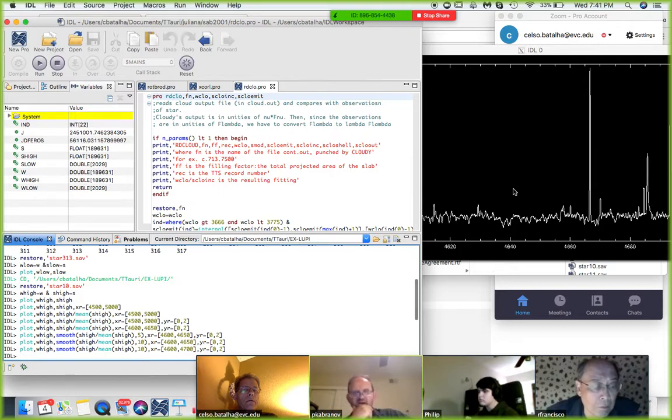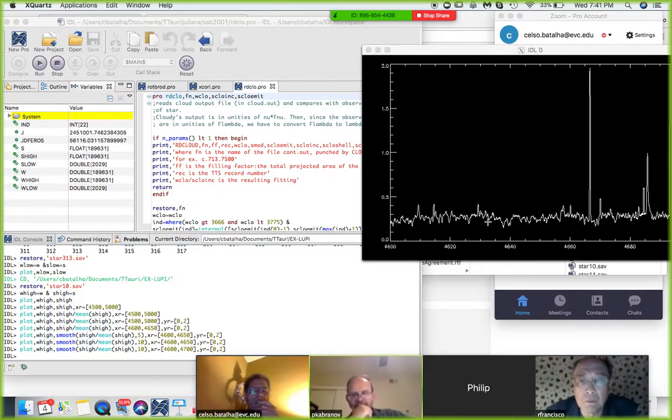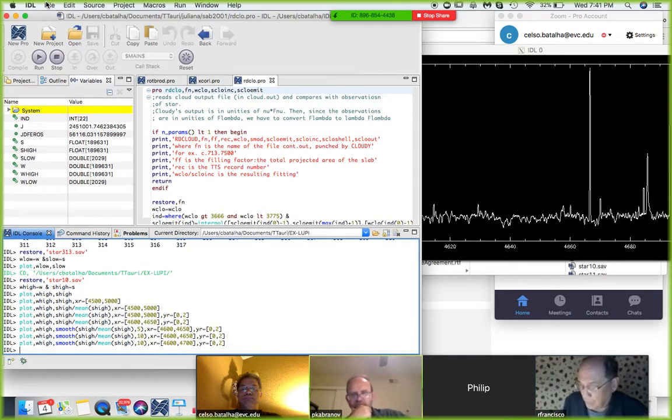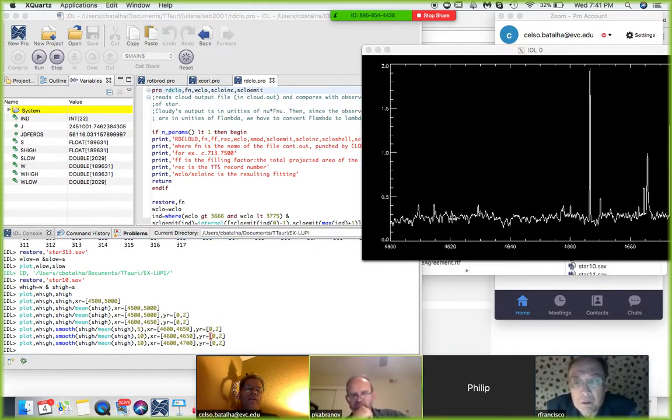So we are deciding how to do the filter. This is the type of thing that, when we start working with data, we make this decision. Say, oh, I don't like the way the data look, I think it's too noisy. And then you go to your logbook, see if there was any problem with the data process, and then you get to some conclusion. Later on, as we advance, I could do what's called normalization.